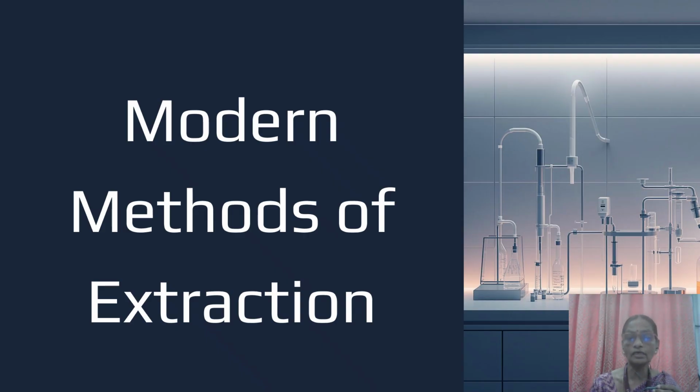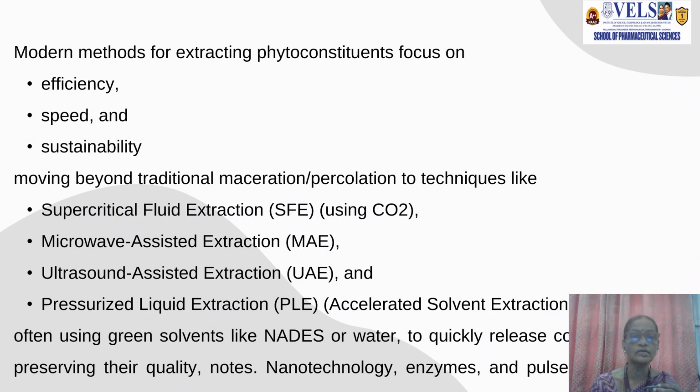Then modern methods of extraction, otherwise known as non-conventional methods of extraction. Here the focus is on the following merits: efficient extraction, speed, less time consumption, and more sustainability. Moving beyond the traditional maceration, percolation, decoction and infusion methods, these are the very important techniques.